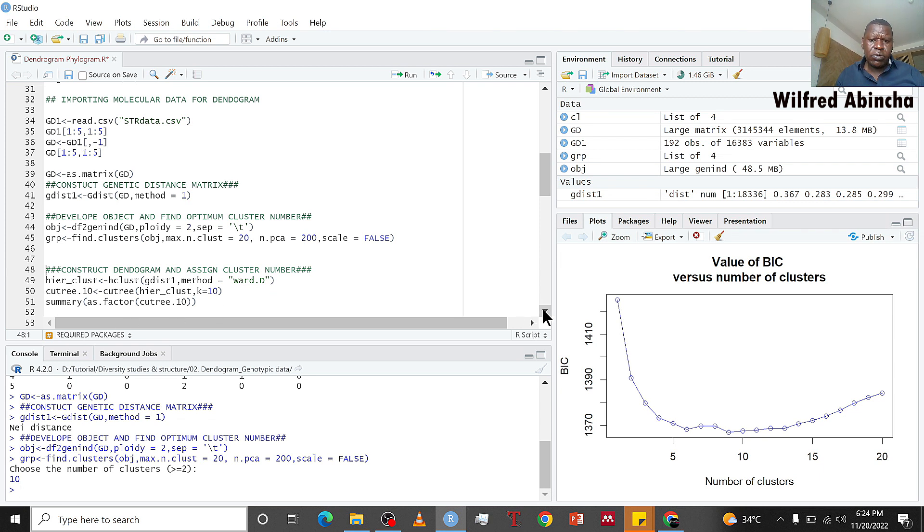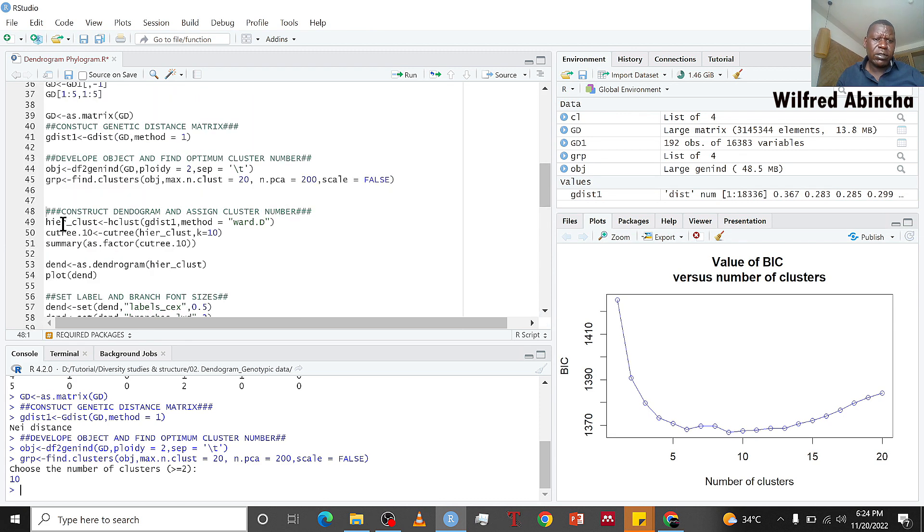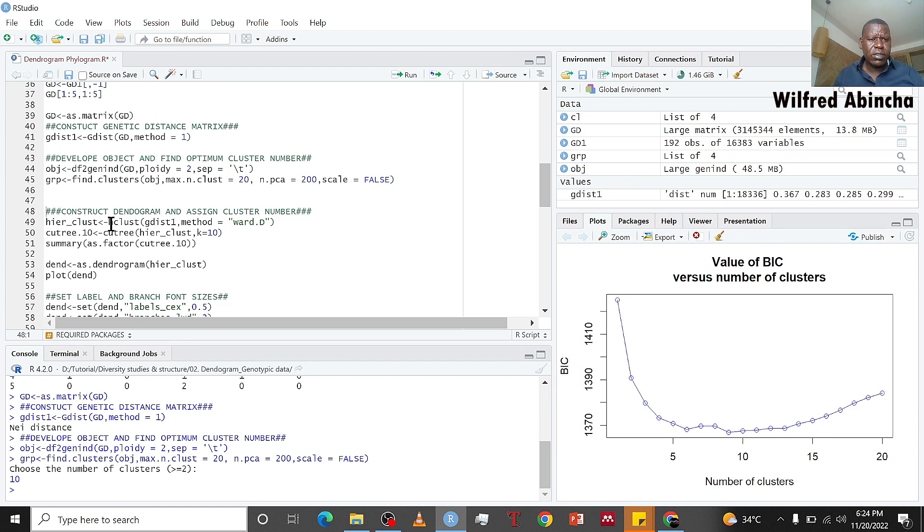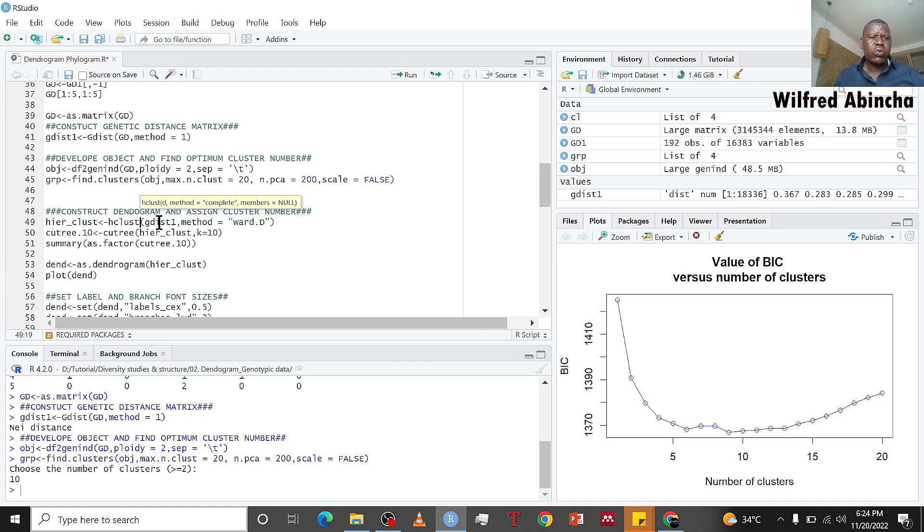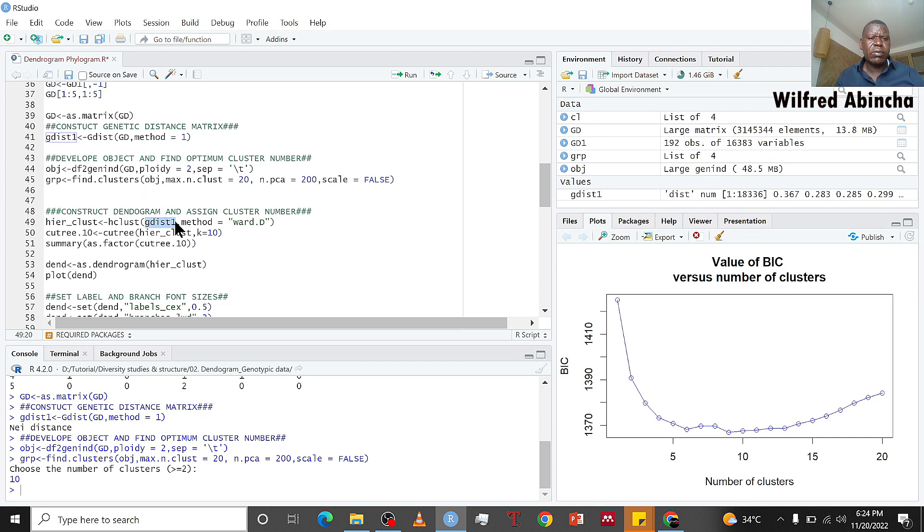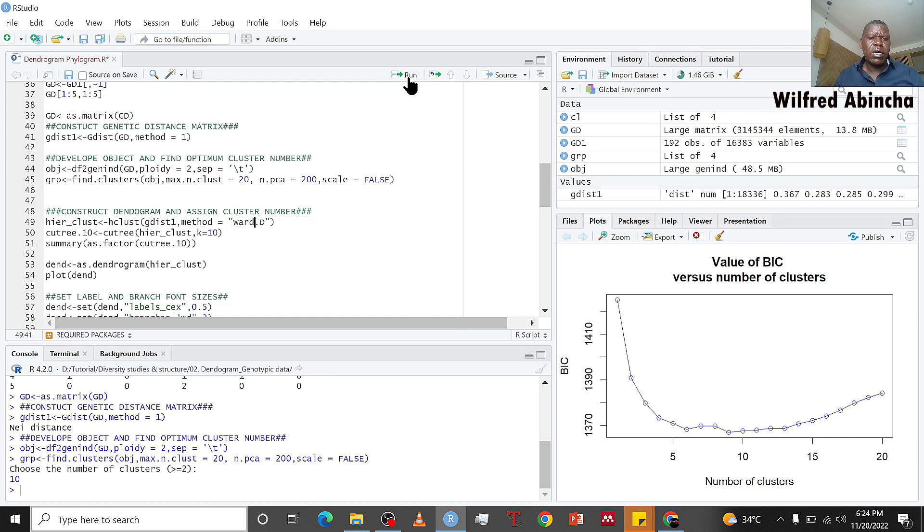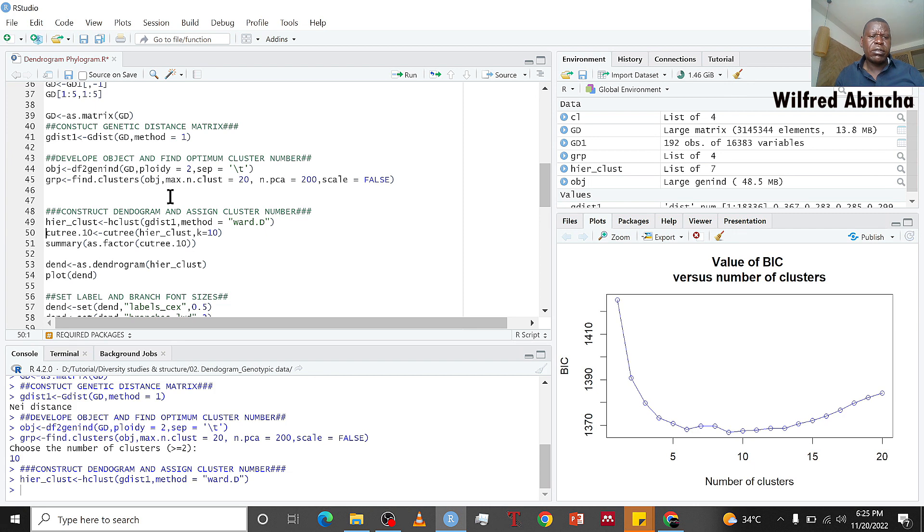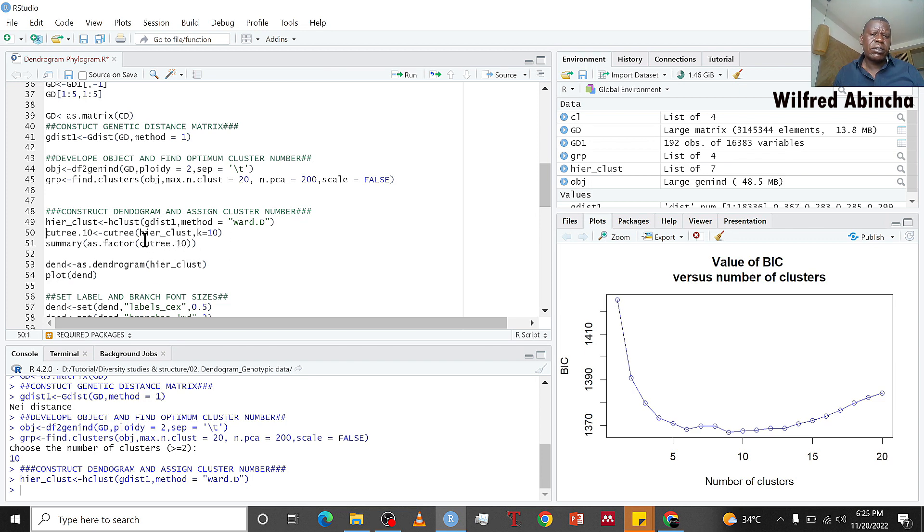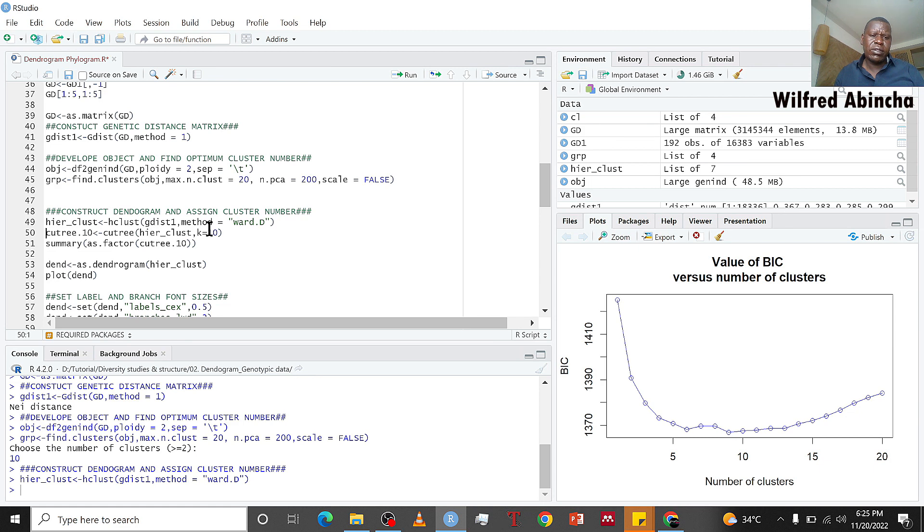Let's go to the next step which is constructing the dendrogram. Here we are using the hclust function for hierarchical clustering. We call it hclust and work on this genetic distance matrix which we constructed, and we are going to use the ward.D method.